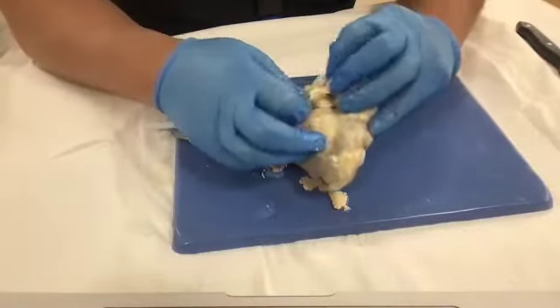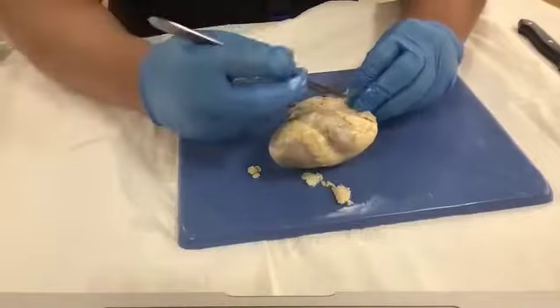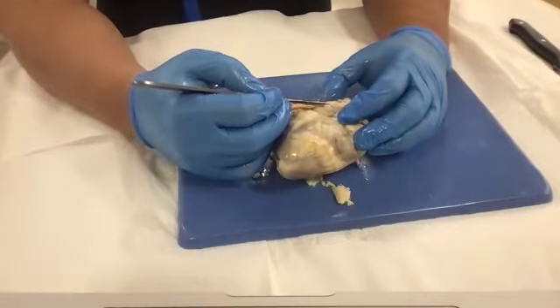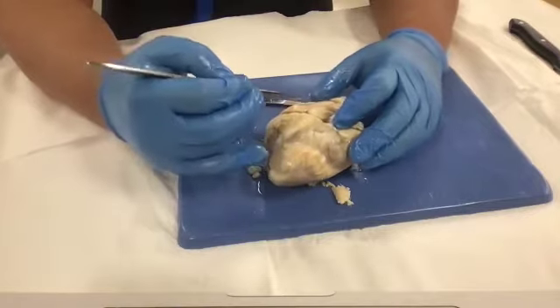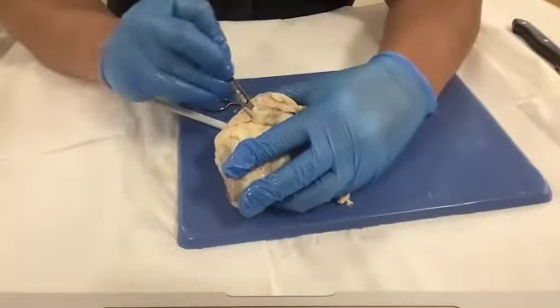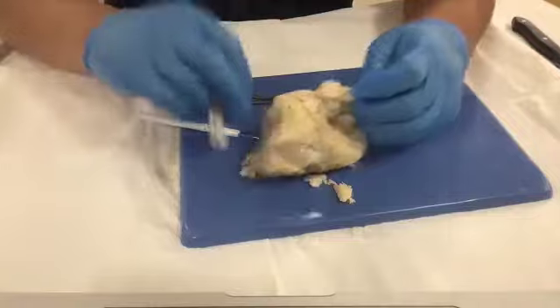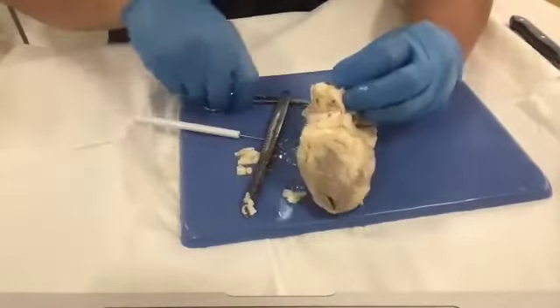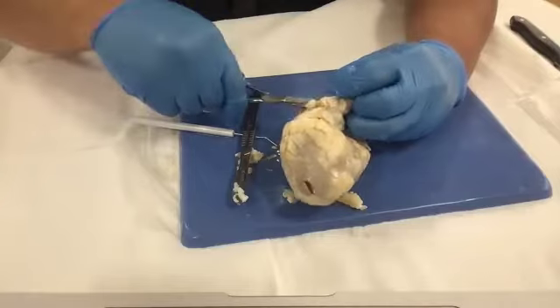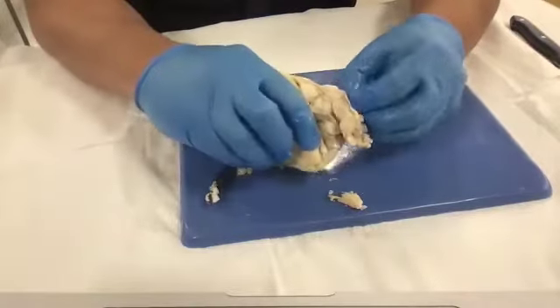So let's open up this aorta, if I can get to it. And with the group with the pig, cut the pig open in the format that the book has, where the dotted lines are. And before you look in and go in there, look at the skin and see how many layers you can identify. Then I'm kind of doing double duty today, but that's all right. Oh, right here. And also for the people who are here who already took the first lab, I'll also make this video available so it'll be a nice review.